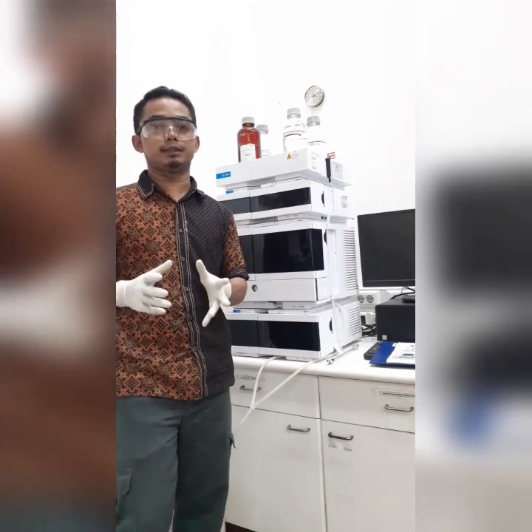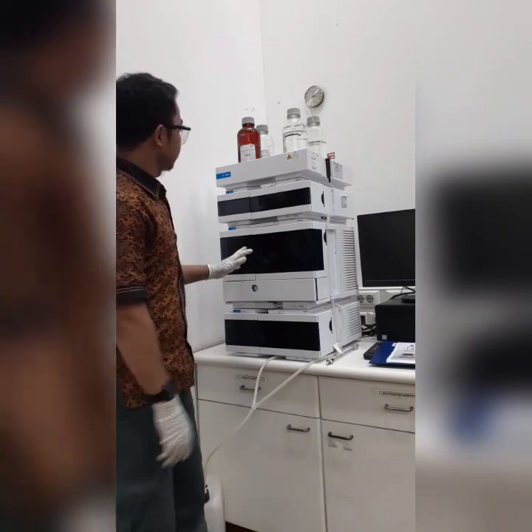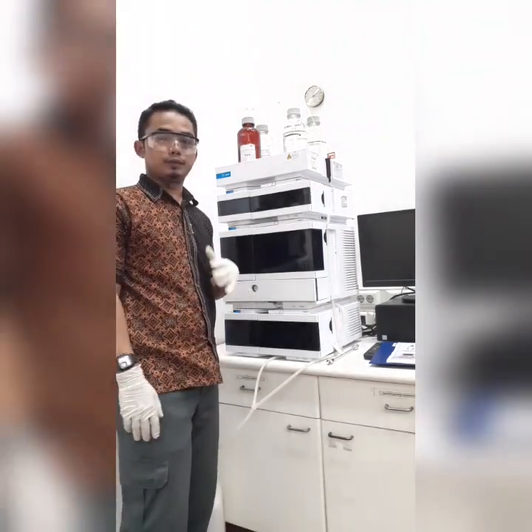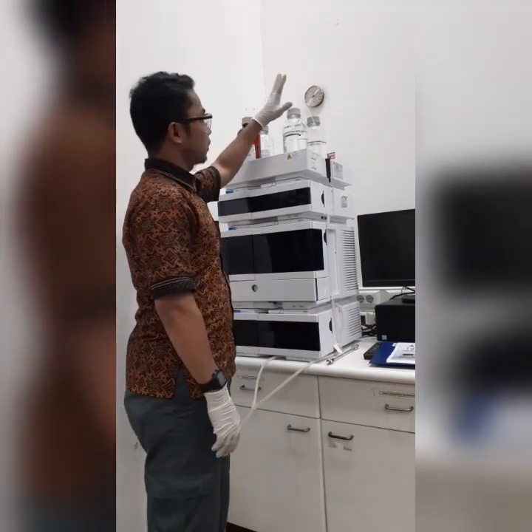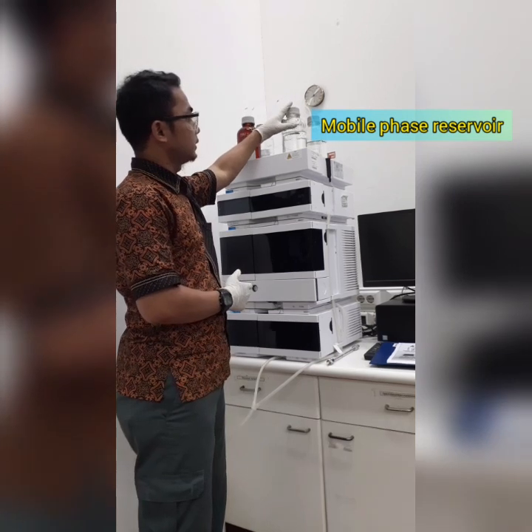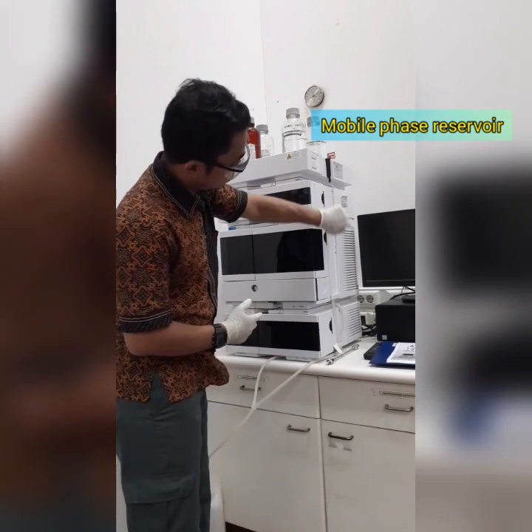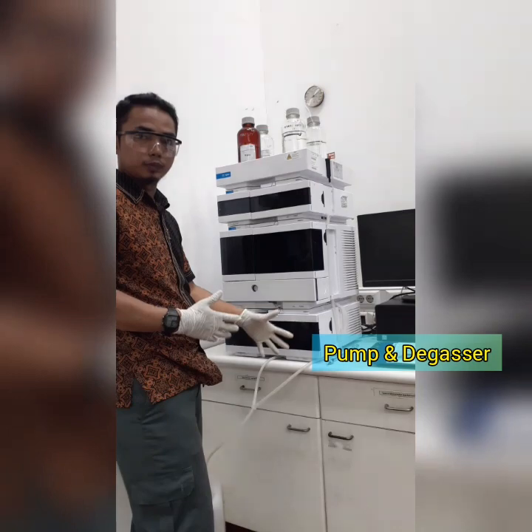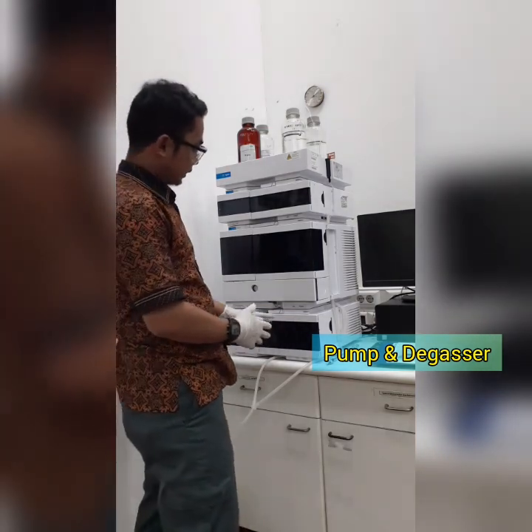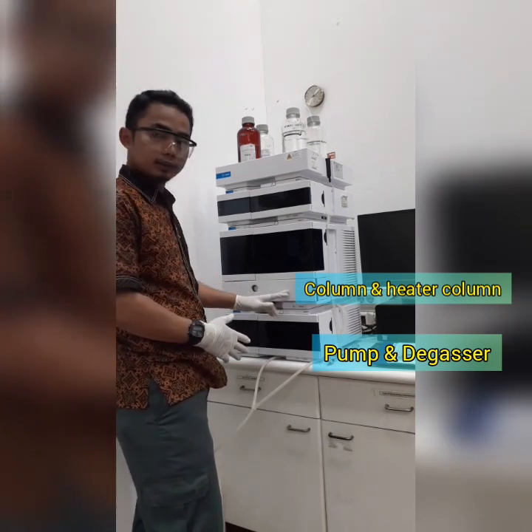Okay friends, I want to show you one of the modern HPLC from Agilent. Okay, this is the unit of Agilent HPLC, 1260 model. I want to show you this is the mobile phase system, mobile phase reservoir, or solvent, and then this is the flow, this is the pump, including the degasser to remove the gas or bubble, and then go to the column, this is column unit.